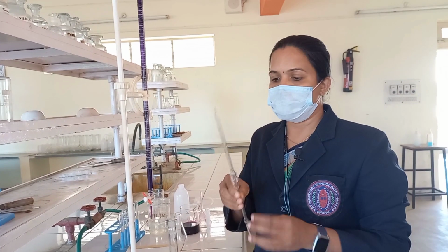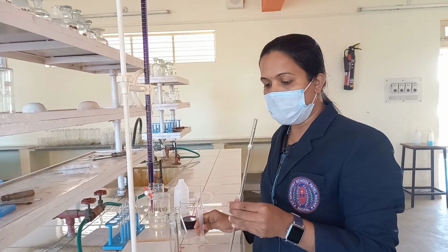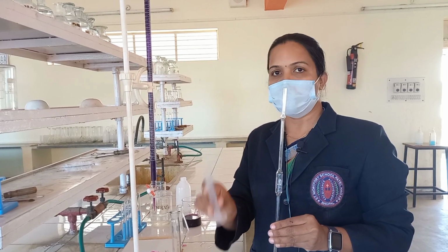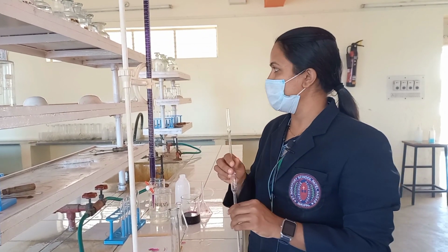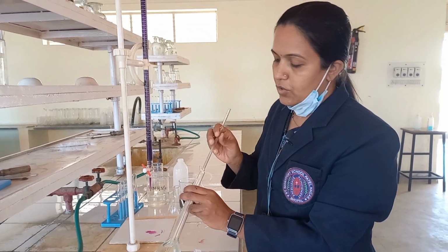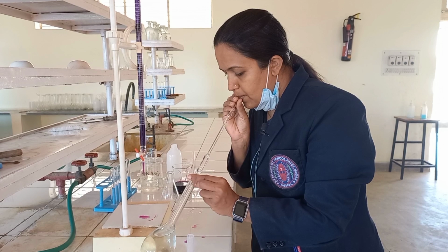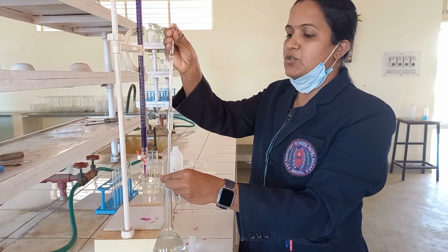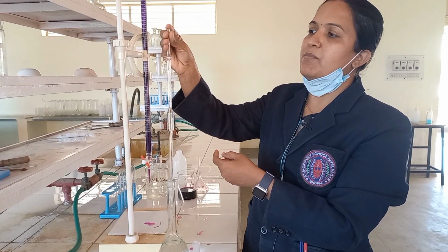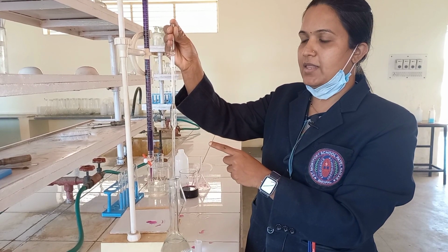And then we have prepared the standard solution of Mohrs salt. This one is known as a pipette. We use the pipette for taking out the salt solution. Either you can use this pipette or this measuring flask, anything you can use. Now first of all I'll tell you how to use this pipette. You insert the pipette into the standard flask and start sucking out the solution, as we suck juice from a straw. On every pipette there is one mark, so you have to draw the solution up to that mark. This is actually a practice procedure.